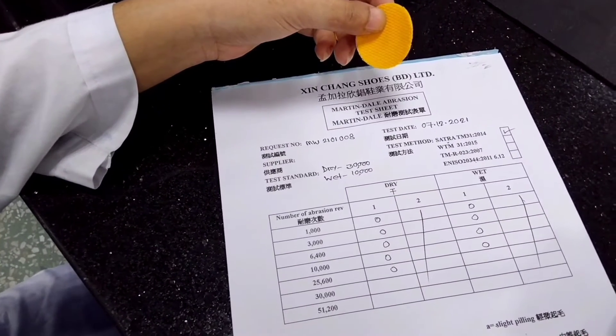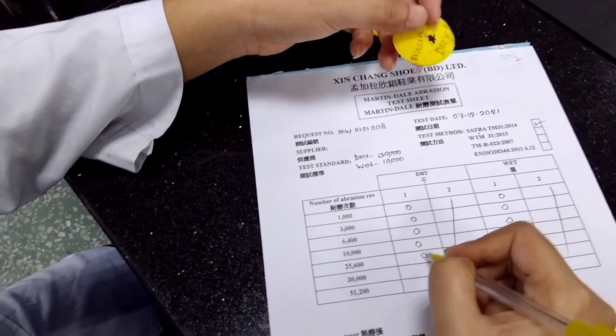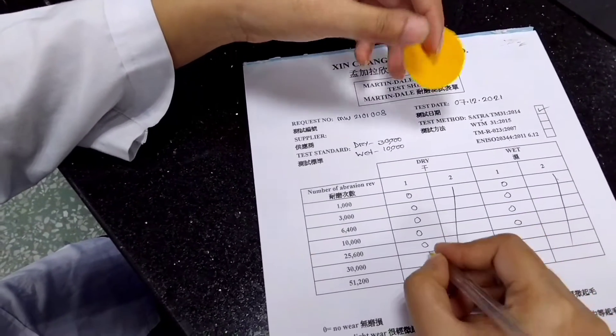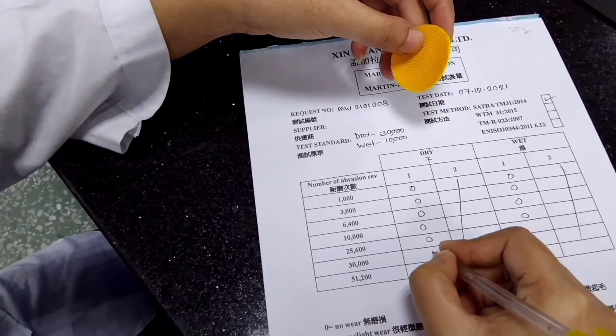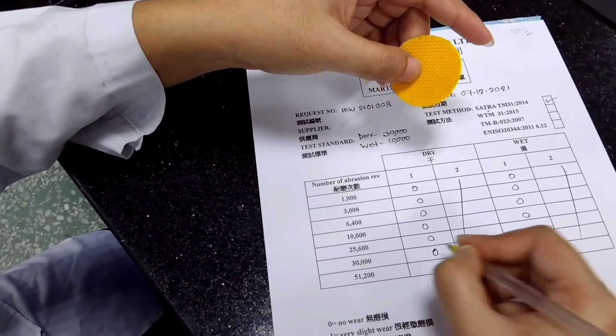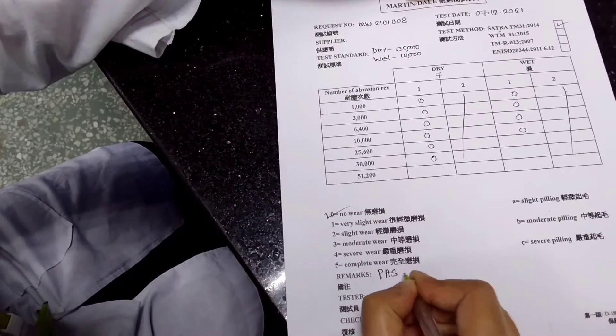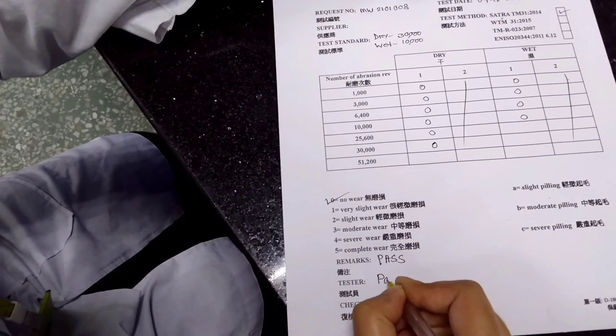After test finished, I am writing the report. Already wrote other results. Now, I am writing the 30,000 result. And there is no pilling. So, I am writing the report. Now — pass. My test is finished.